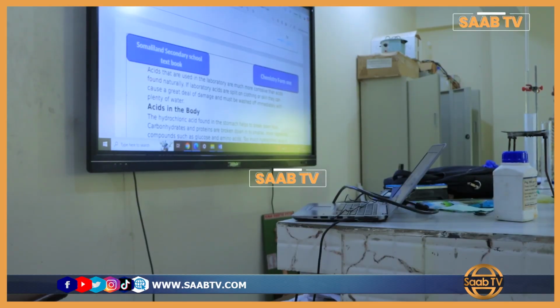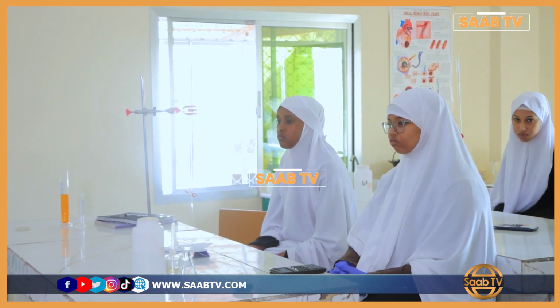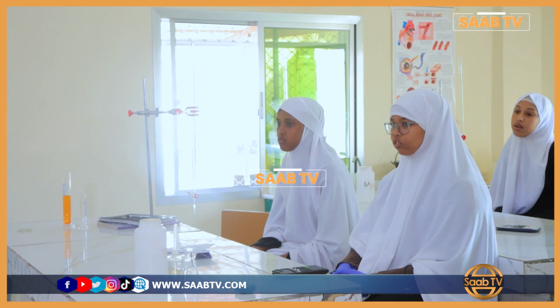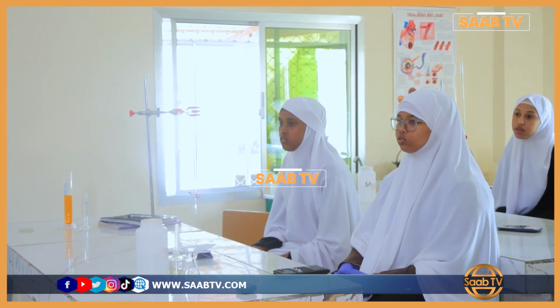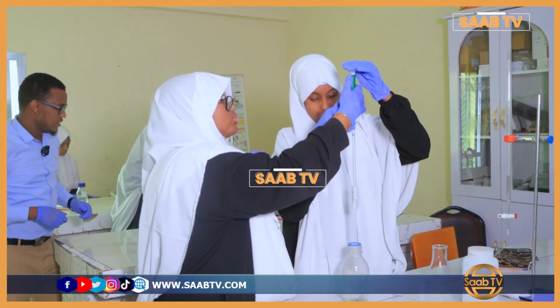So what are we going to use this one for? To get the amount of alkaline. To take the 25 cubic centimeters of sodium hydroxide. So the alkaline that we have will be the sodium hydroxide. So what's called that one? It's called the burette. So what do I use this one for? To measure the amount of the acid.